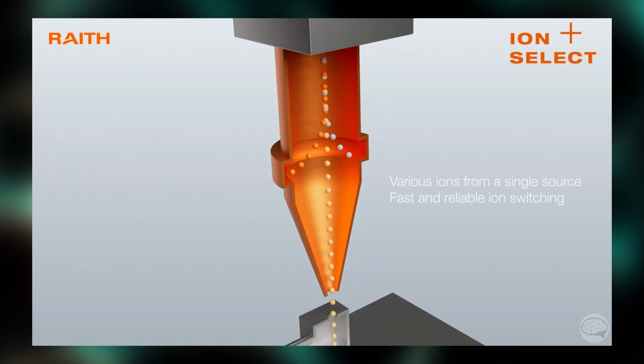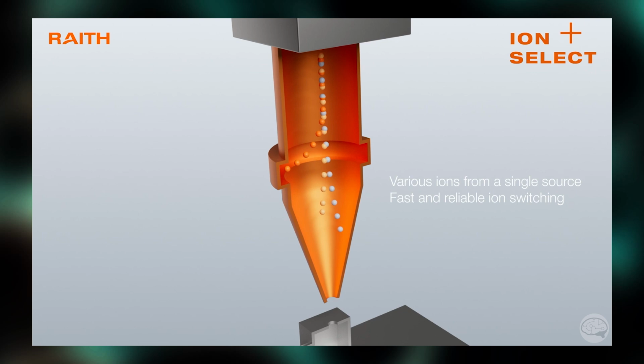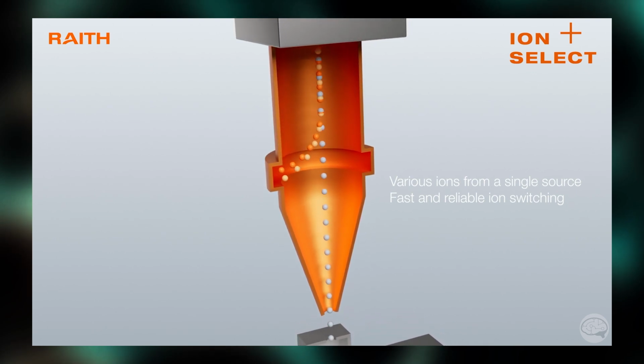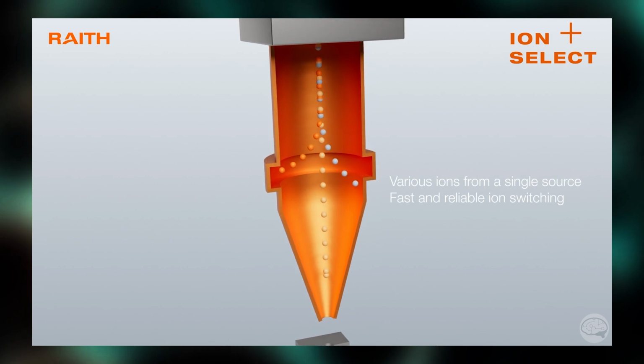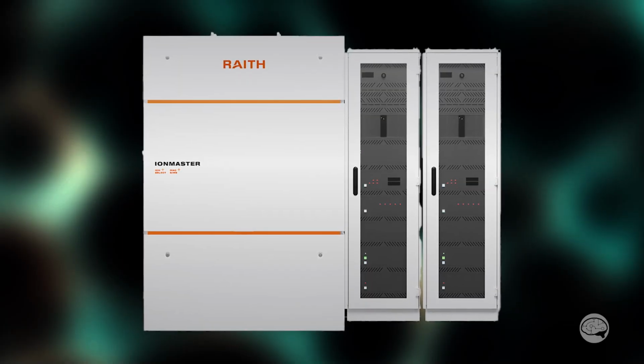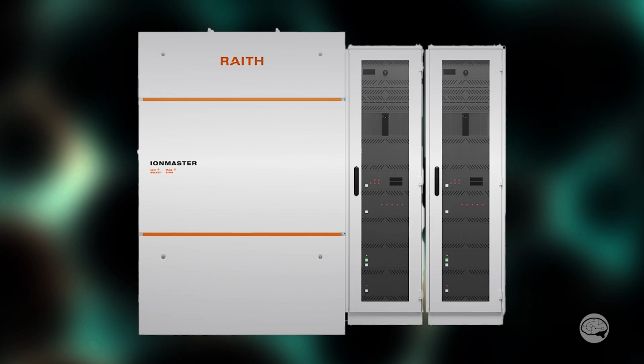Okay. So Peter, tell us about the new instrument that you guys have here at the show. So I'm here to promote our new tool, the IonMaster, that we're launching during the show, during this M&M. And this is a high-resolution analytical ion microscope. It's designed for highest resolution ion beam imaging. And at the same time, we can do highest resolution SIMS analysis on samples, nanoanalytics, and we can cover the whole periodic table, all the isotopes there.